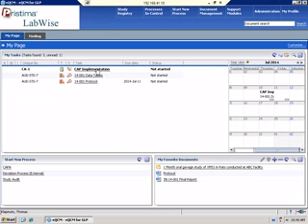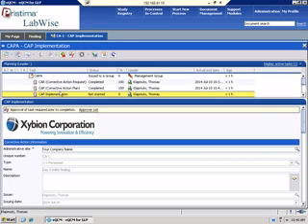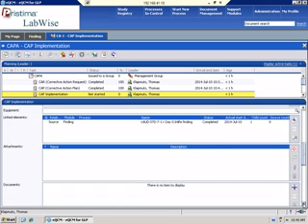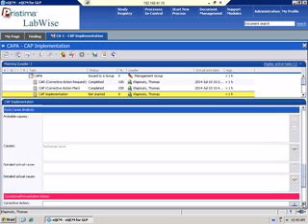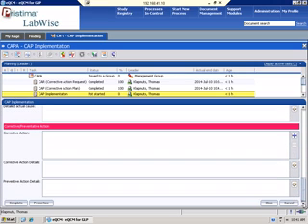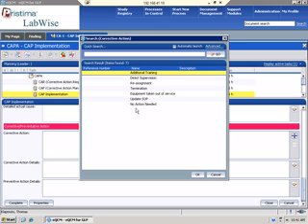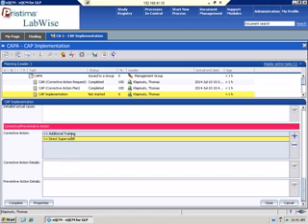And so now we're on to the CAPA implementation. So here again, we have an approval. We work through the form. There's all the information, the detailed information, causes, and then here's what's the corrective preventative action. The corrective action, I have a few. This person needs to get some additional training. They also need to get some direct supervision. Again, you can build this list. So those are the 2 corrective actions that we're going to do for this employee.